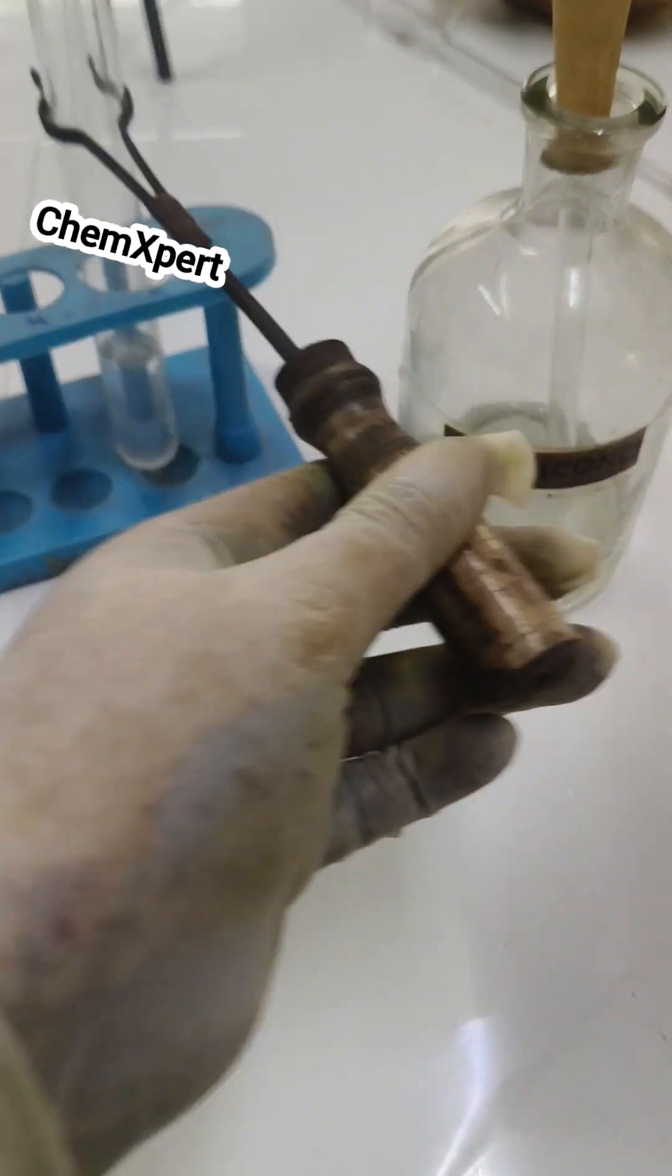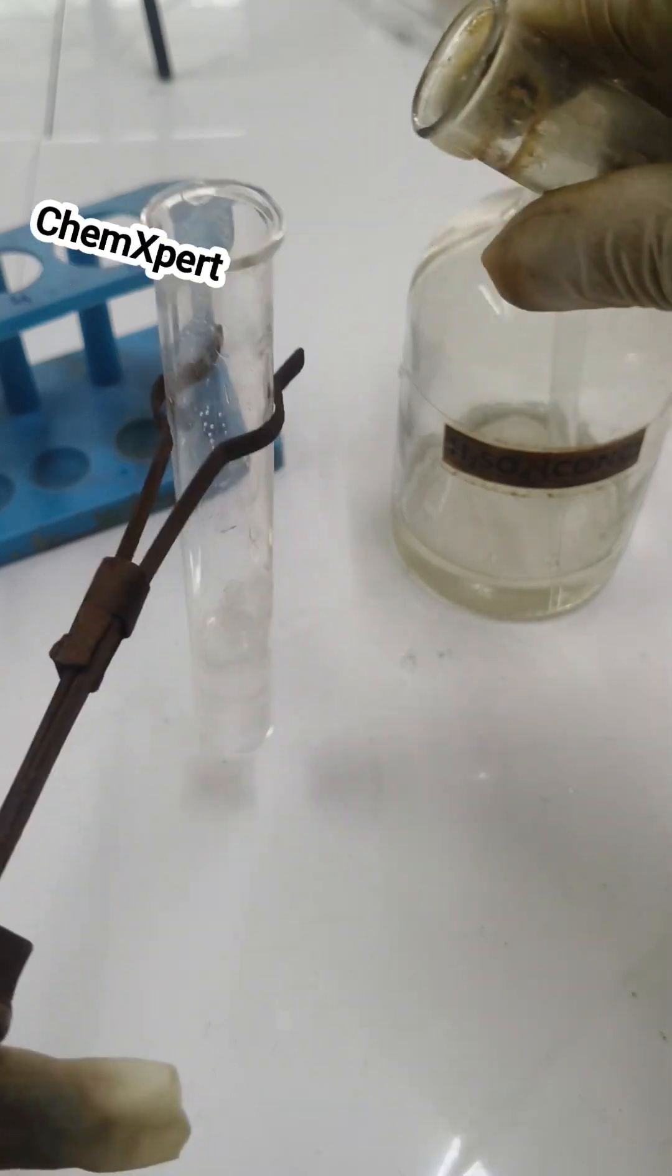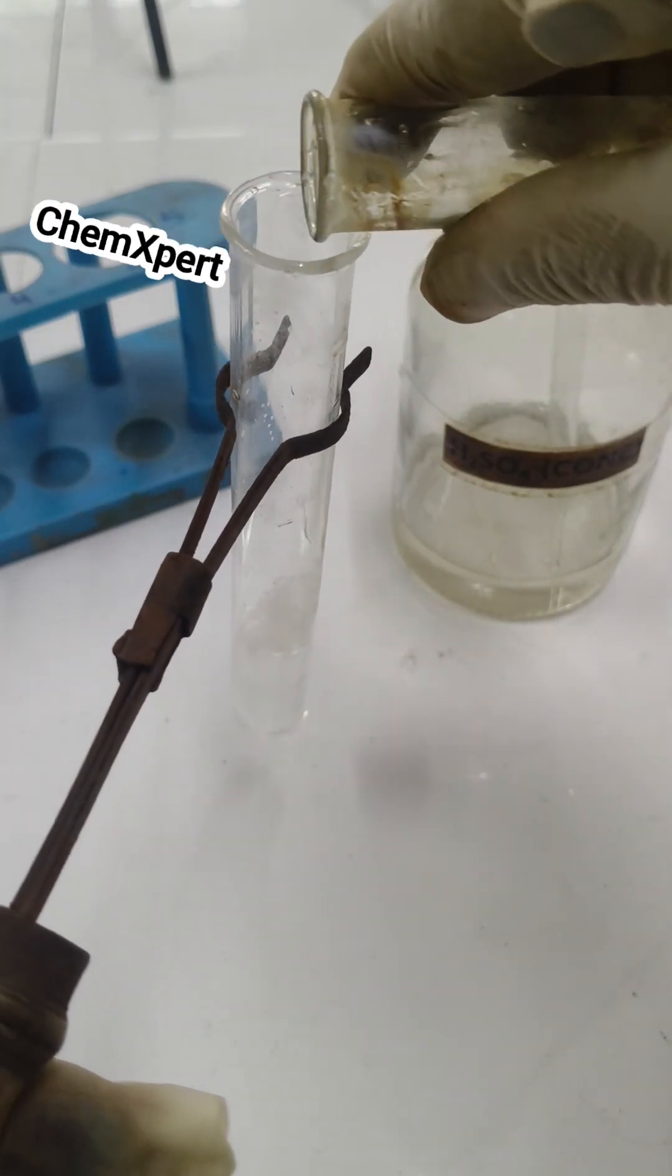In another test tube, prepare the freshly prepared FeSO4 solution, that is ferrous sulfate solution, and add this solution to the test tube.